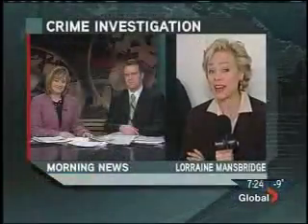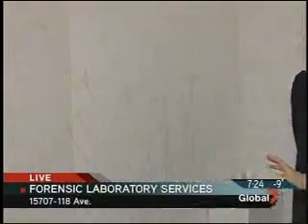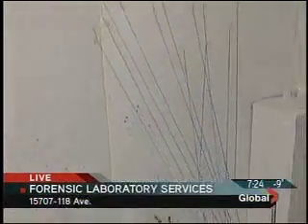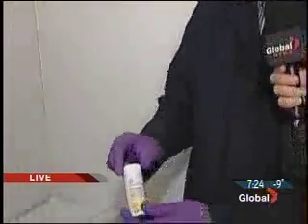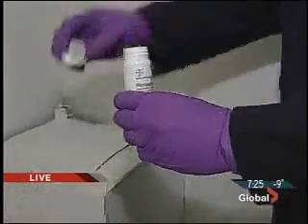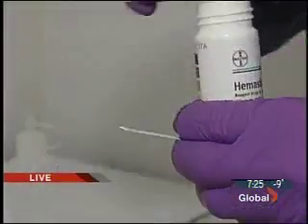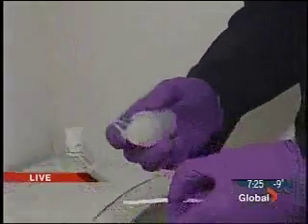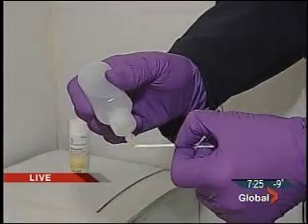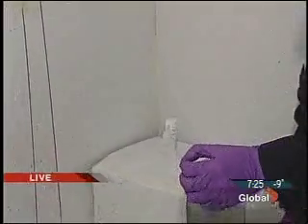Very cool. Blood spatters. The first thing, we're in a room that would recreate a crime scene. The first thing you want to determine, John, you were telling me, is? We try to determine if this is blood, and by doing that, we have a presumptive test, and we use what we call a Hemastick. This is a reagent strip, and on the end it's got a chemical base, tetramethylbenzidine, and we wet the end of this reagent strip with some distilled water. Give it a shake, and then we apply this to what we presume may be blood.